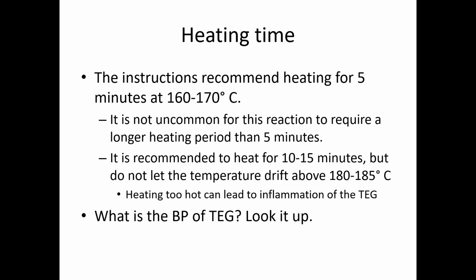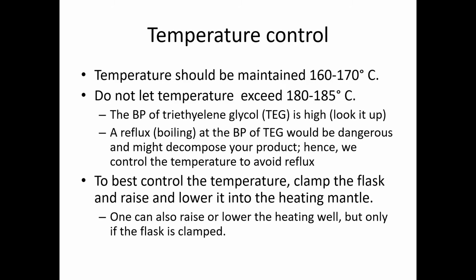So for this experiment, it's important to know what the boiling points and melting points of different compounds are. So it's always good to just look up the boiling point. For example, you should probably look up the boiling point of the triethylene glycol. So again, it's always important to maintain the temperature around 160 to 170. Try not to ever let it exceed the 185 mark.